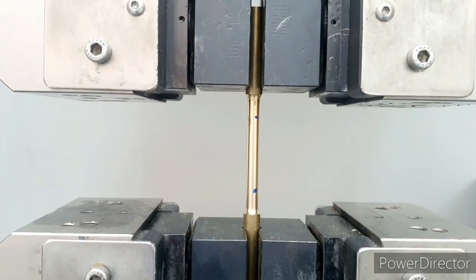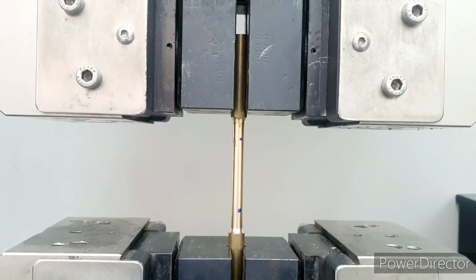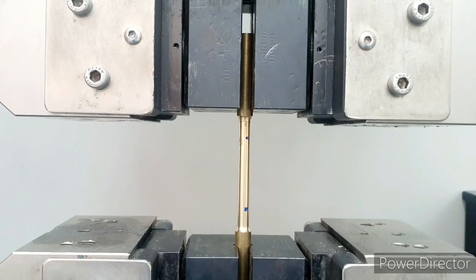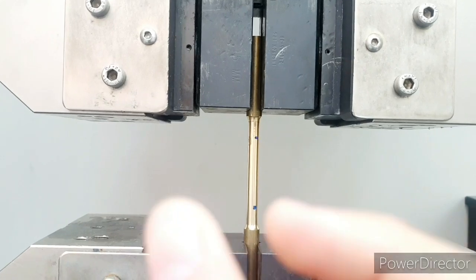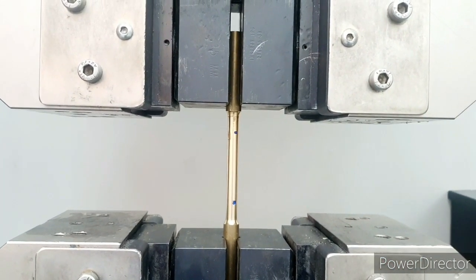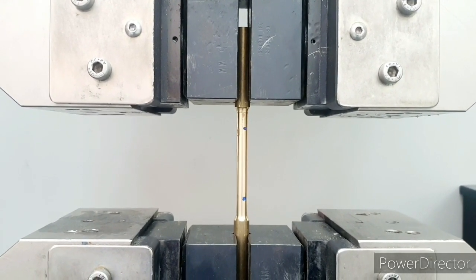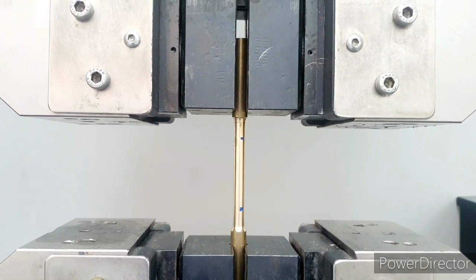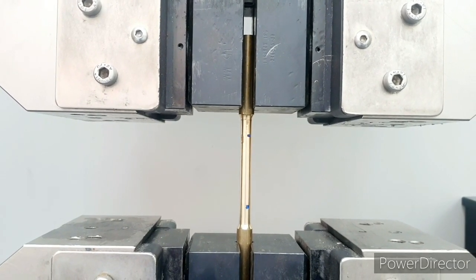It is important to keep the video in the same view, as brass is a brittle material, and here the breaking can happen all of a sudden, and we will not notice very big area reduction, which means the necking will not be that visible from the center of the material. So it will break without giving any clear and visible indications, as we can see now. So now it can break any minute.